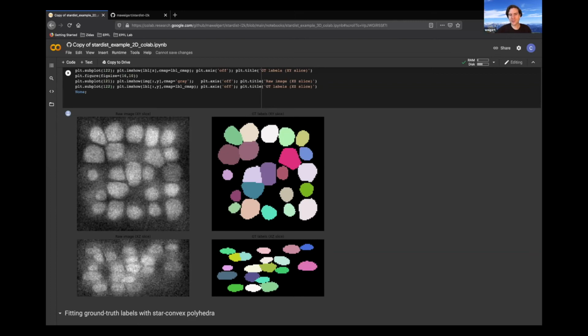So the anisotropy factor means: with what factor do I have to scale everything along each dimension such that they will be spherical at the end? And that's essentially, I have to scale it up twofold along this dimension and leave it in the others. And then they would become perfect spheres, right? That's the meaning of it.